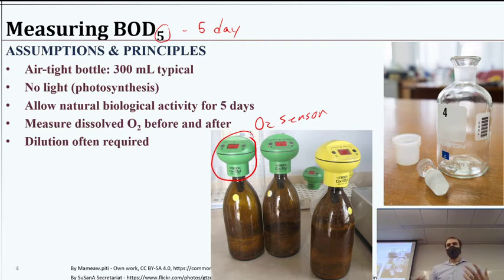And so essentially, since we're measuring before and after, we get a picture of how much we started with versus how much we finished with. So there are some important parameters here, important caveats that we're going to get into with our calculations.